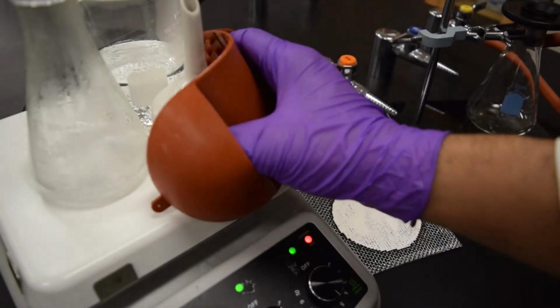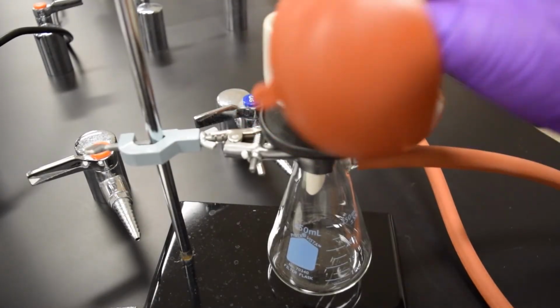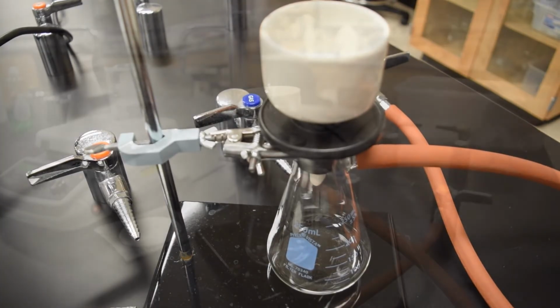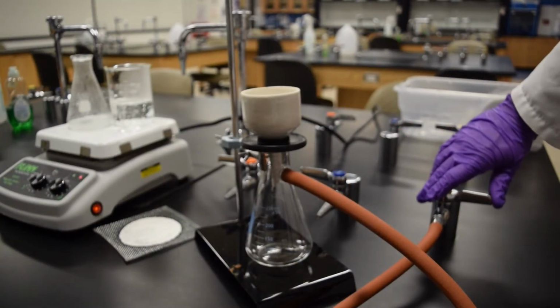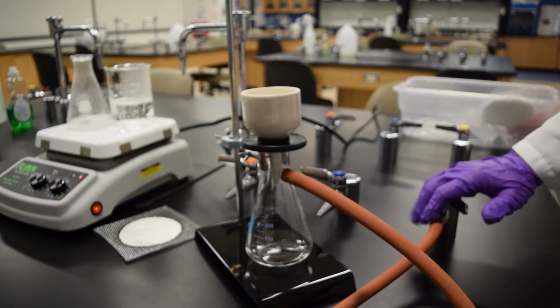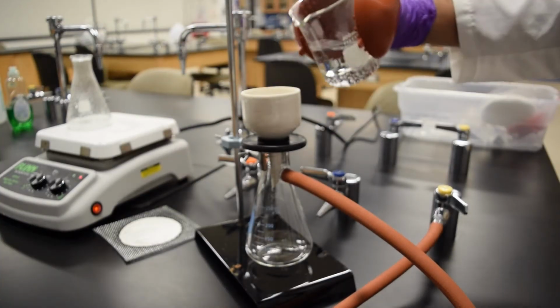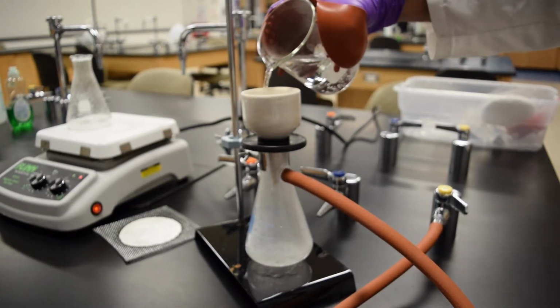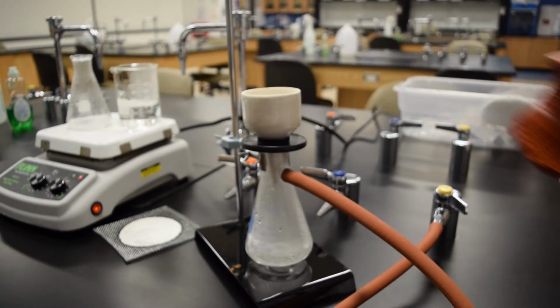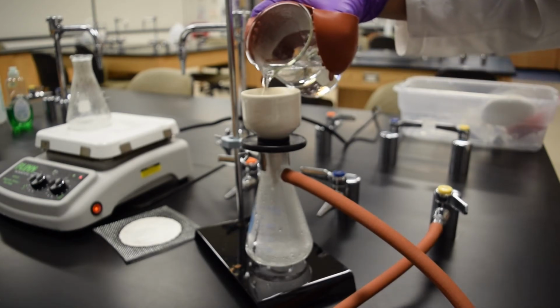After setting up the vacuum filtration, use the hot hands to place the Buchner funnel on the vacuum flask. Then, run some hot water through the Buchner funnel to wet the filter papers. Remember, you want to keep the funnel as hot as possible. Otherwise, the benzoic acid will freeze and clog the funnel.